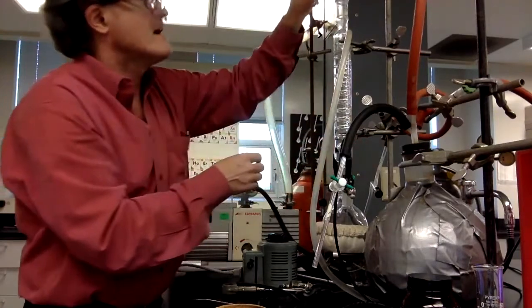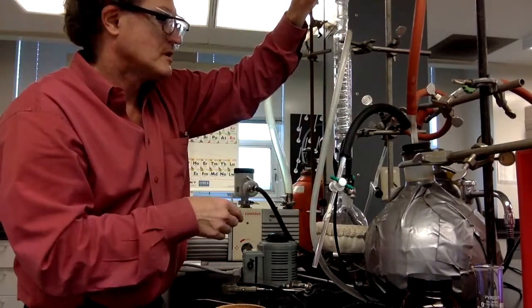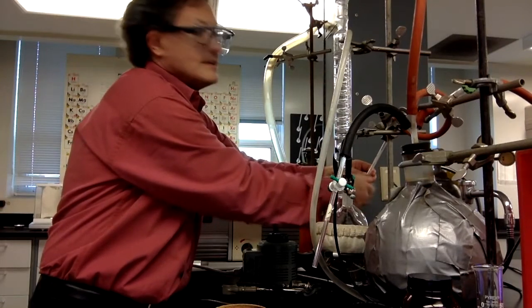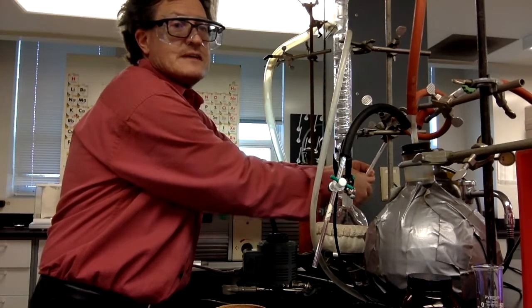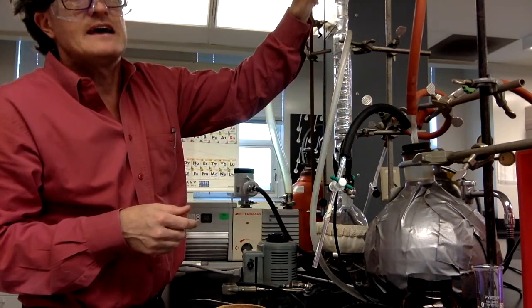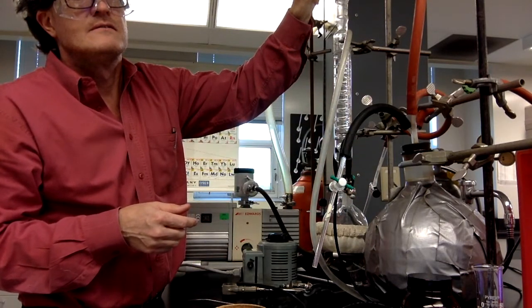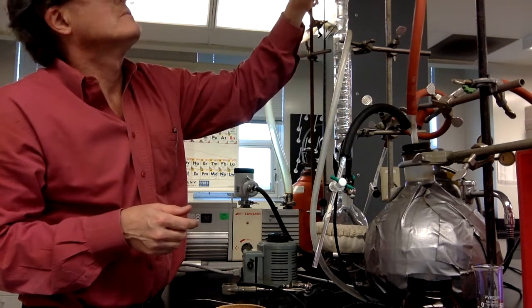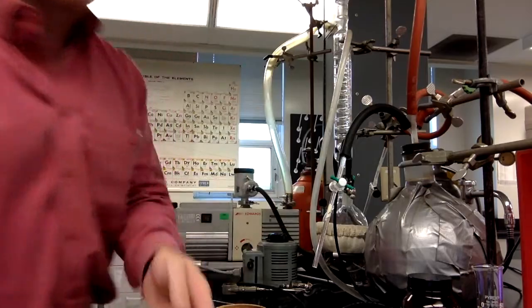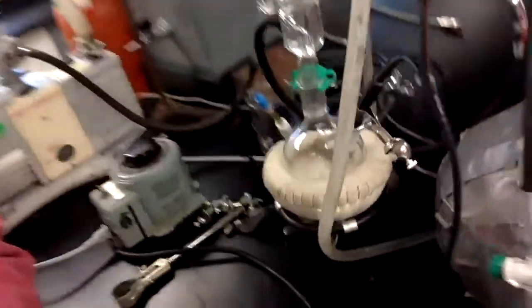Okay, so now pressure's pretty low. I think we'll close this off. And let's take a look. We want this to sort of stabilize around 7 to 10, something like that. We've got this all the way open. And now the pressure is slowly coming up. It's still bubbling around a bit, right?